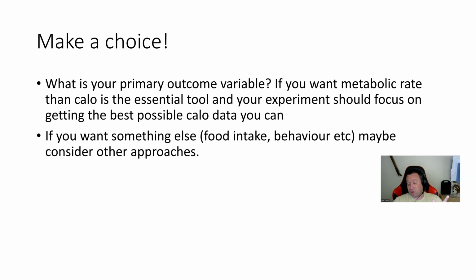The food intake and water intake, we saw where we had food on the cage floors and gel pouches. You'll lose your food and water intake from the hoppers, because the stuff on the floor of the cages, the mice can go eat. But you will reduce the weight loss and you will reduce the negative energy balance, and you may get longer-term, more representative energy expenditure of the free living environment.